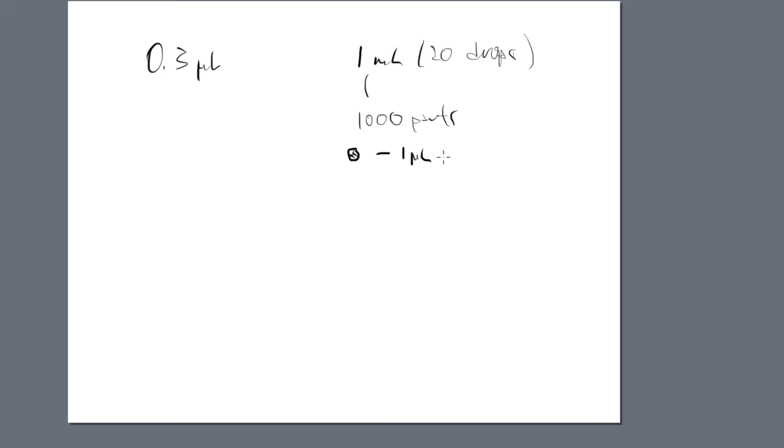And we go into the vicinities of 5 microliters, 10 microliters, maybe 1 microliter. But that is way too much stuff for this machine to do its job. So basically what that means is that we take a milliliter of solution, we bust it up into 1,000 equal parts, and one of those equal parts is a microliter. That is still way too big.